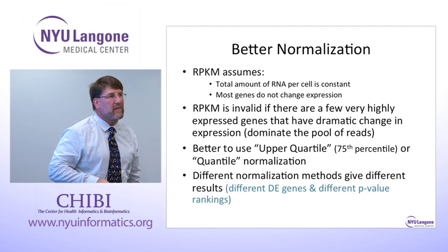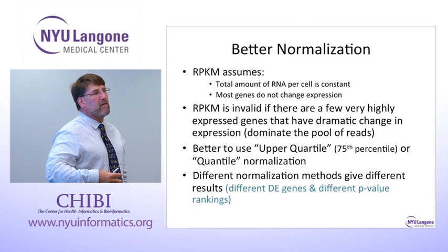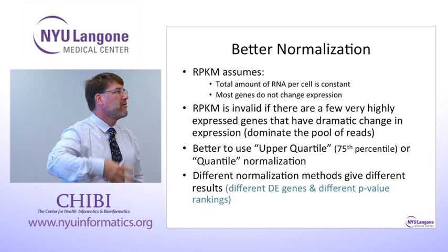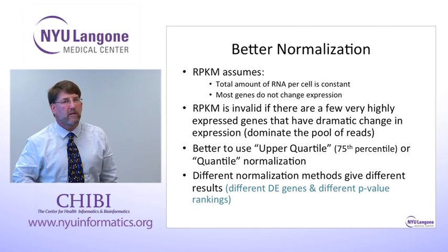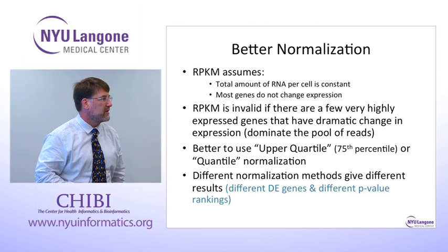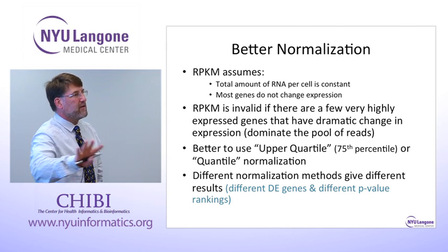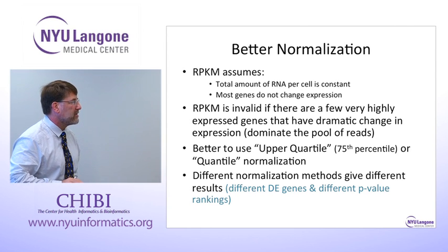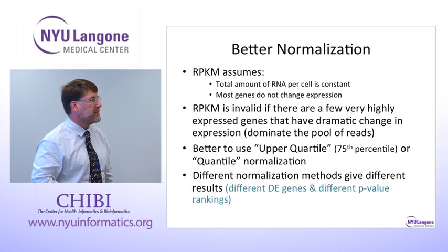And so normalization methods are trying to take this into account. But if you design a normalization method to explicitly take this into account, you're probably creating other problems in samples where that's not happening. So it's a real challenge right now, and there's a lot of different papers being published in the statistical literature, and there's not a perfect solution. Probably for very different types of experiments, there are different optimal statistical methods. And there's probably not one statistical method that's optimal for all types of experiments.